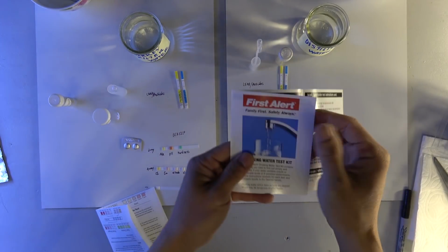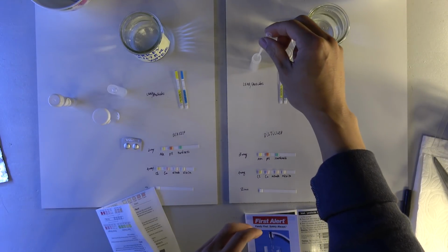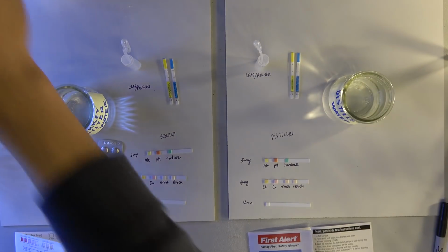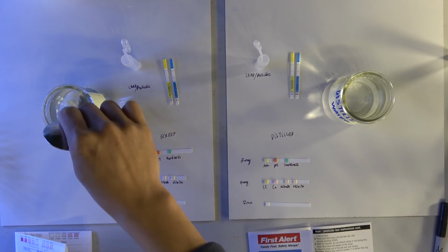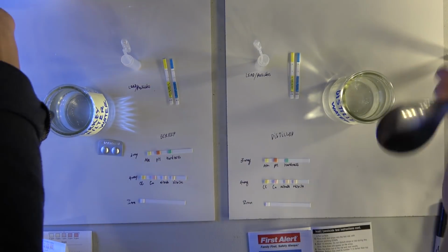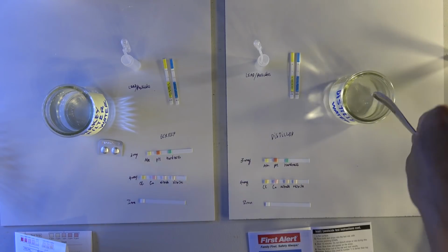For the First Alert, they said you need 2. So 2 squeezes of water into this vial. So here we go. Actually, I'm going to mix it up thoroughly before I take the sample. Okay, and I've got the other spoon for the other test. Mix it up thoroughly.